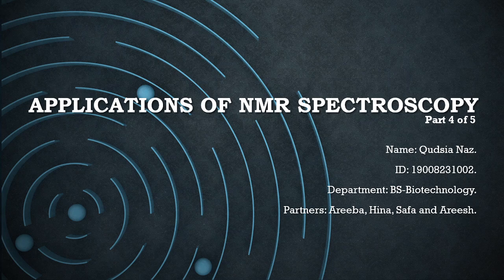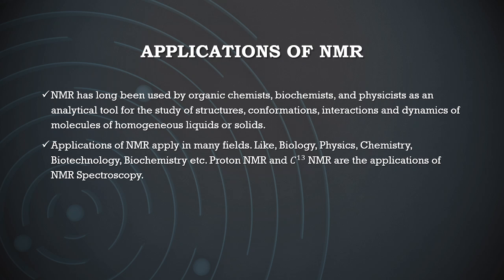The topic of my presentation is the applications of NMR spectroscopy. NMR is a phenomenon in which particular atomic nuclei respond to the application of certain magnetic fields by absorbing or emitting electromagnetic radiation. NMR has long been used by the organic chemist, biochemist, and physicist as an analytical tool for the study of the structures, conformations, interactions, and dynamics of molecules of homogeneous liquids or solids.